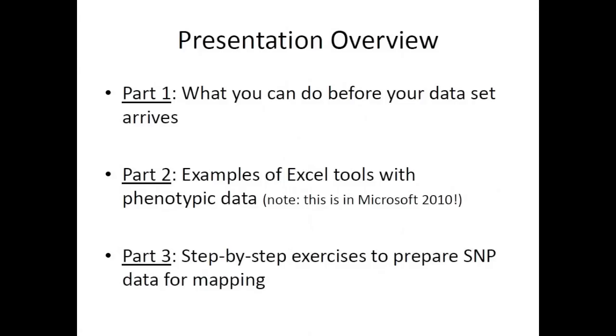So I have three different parts that I'd like to go over for the presentation. One is what you can do before your data set arrives. Two is examples of Excel tools with phenotypic data. And I just want to note that this is in Microsoft 2010. Part three are some step-by-step exercises to prepare your SNP data for mapping.